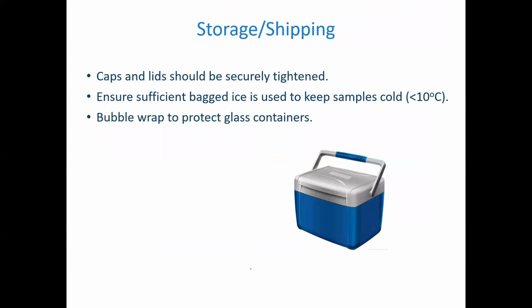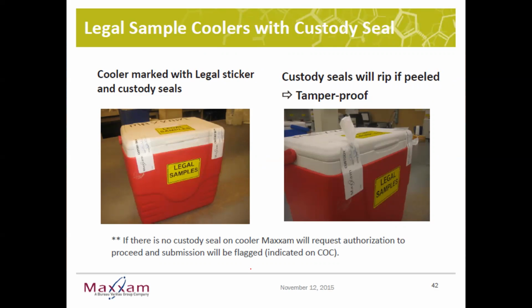I guess we talked about this already. Usually there's ice, sometimes there's bubble wrap to protect glass containers and so on. And that's kind of how the sampling is done.